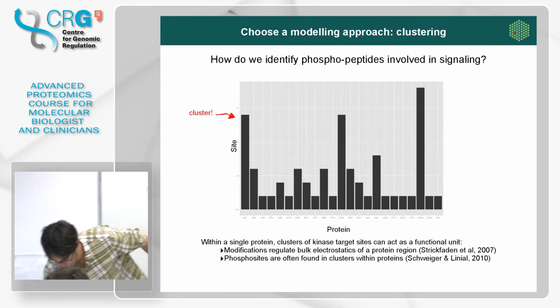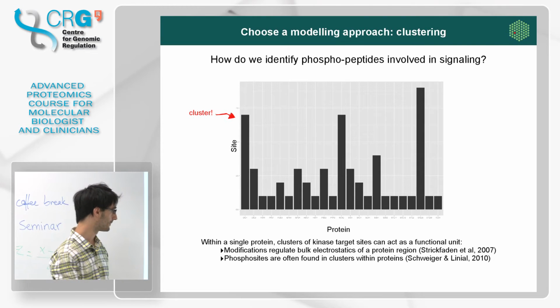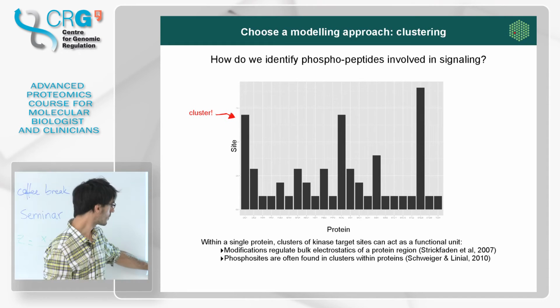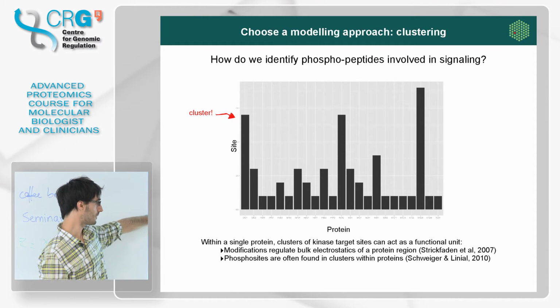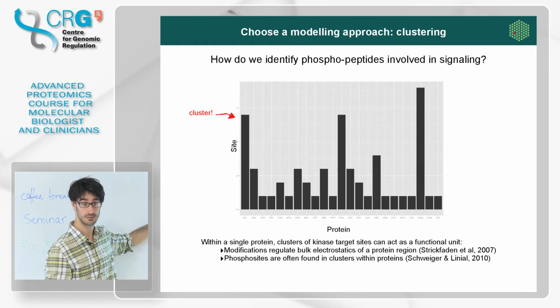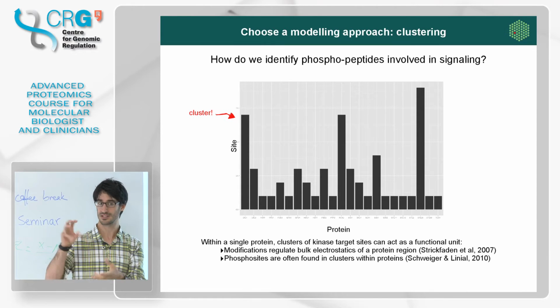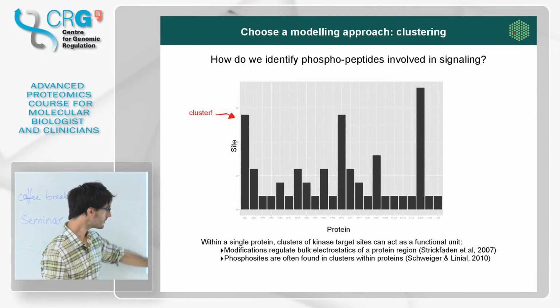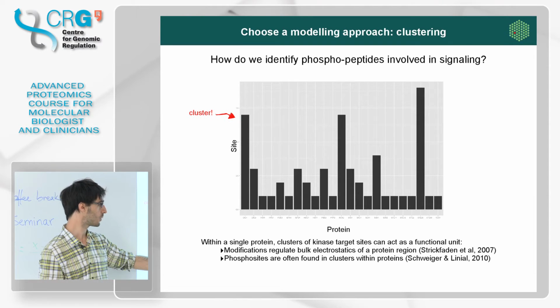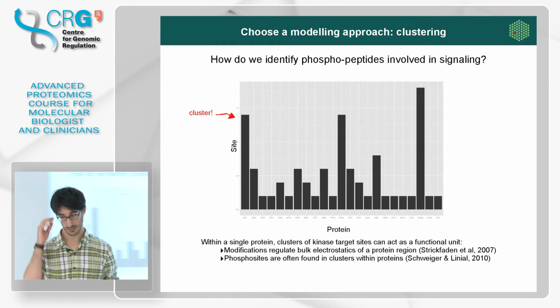All the way to the left, there's dig1, then there's dig2, and far1, and so on. So these are some proteins here. Now for these proteins, this is the number of the phosphopeptides that were detected. So for this protein, dig1, we detected 7 phosphopeptides. Right, so should I go and put these 7 phosphopeptides in my signaling network, which is based on proteins? That's the question. For other proteins, we detected 3, and for some of the proteins, we detected just 1 phosphopeptide, and so on. For a protein here, we detected 9 phosphopeptides.